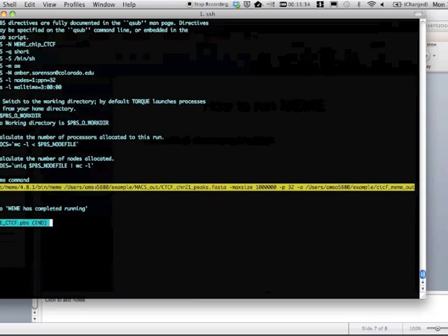So here I've linked to that peaks.fasta file, which is the file that you need. I changed this max size. The reason I changed this is it defaults to like 100,000, and the first time I ran it, I got an error, and so all I did was just up this by another 0. I multi-threaded it, and then I gave it an output directory to go to.